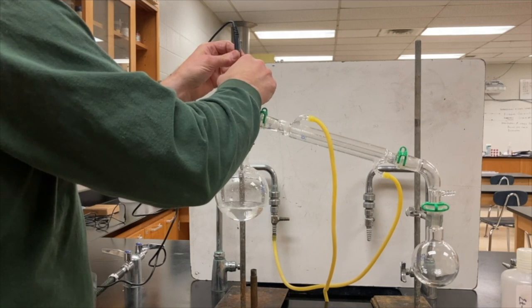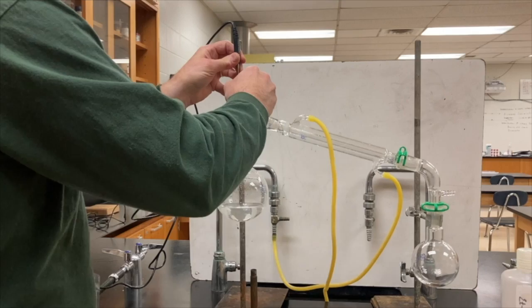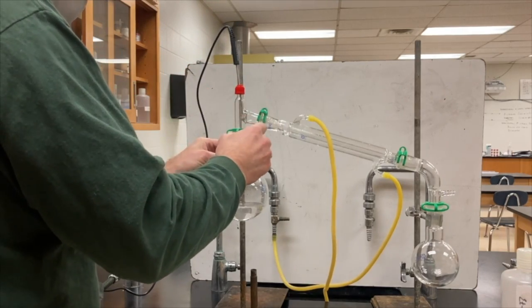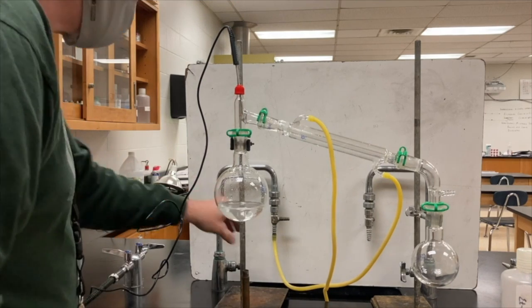I'm now inserting a temperature probe, and I'm going to put this probe above the liquid quite a ways, so it's going to lag a little bit behind the temperature of the actual liquid, but it'll give the temperature of the vapor above the liquid.